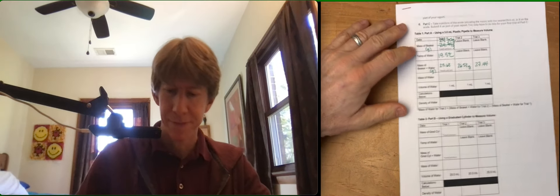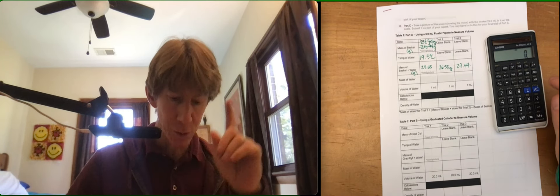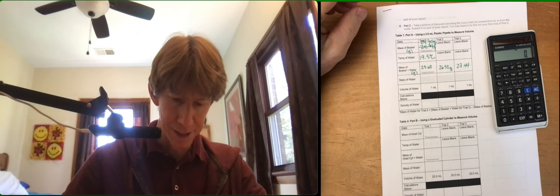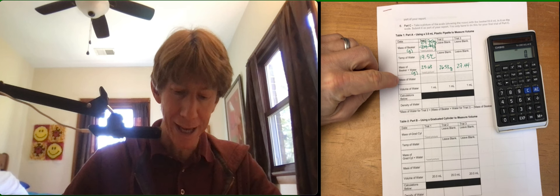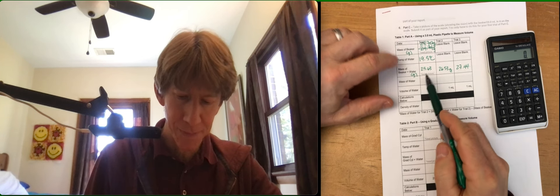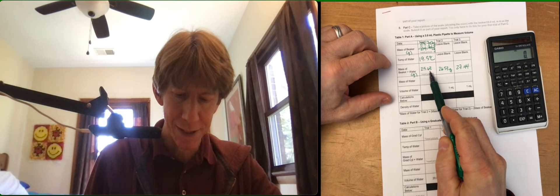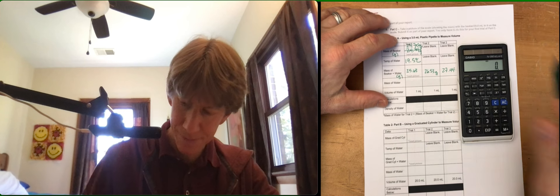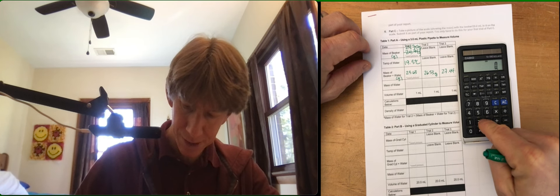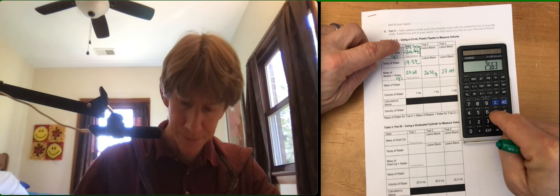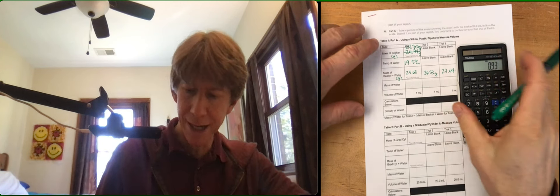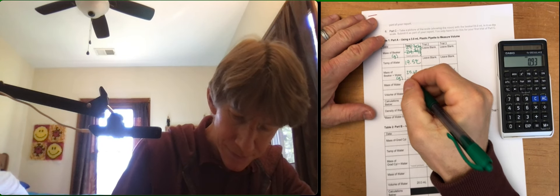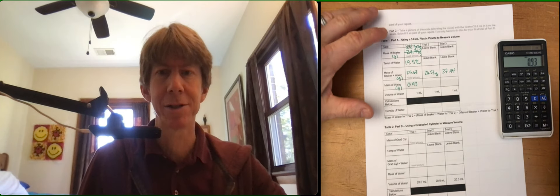All right, I do have my calculator, I'm delighted to say. Let's start by doing mass of water. Our mass of water is going to be the mass 25.63 minus 24.70. For this first one anyway, minus 24.70, I get 0.93 and that's going to be grams as well, so I'll write that there.